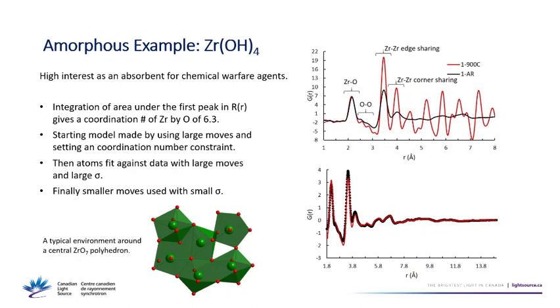Like if you have zirconium oxide, ZrO2, then the zirconium are all 7 coordinate. So I think here they're usually 7 or 6. I think probably there might be a lot of terminal oxygen that aren't sharing there. So yeah, it's an average. It's a mixture, probably 6 and 7 coordination.